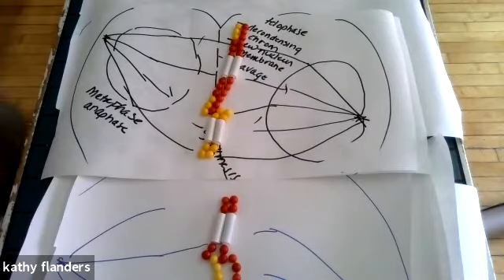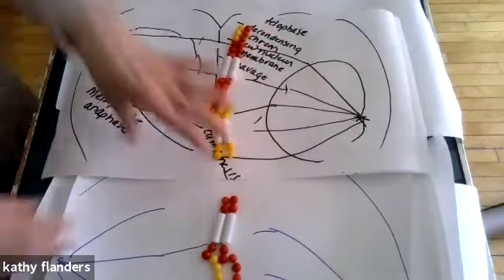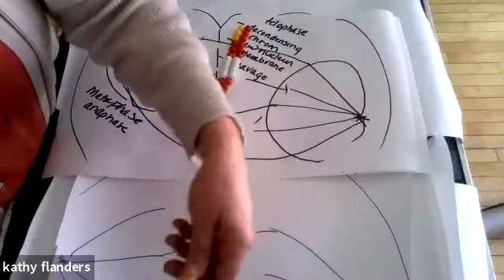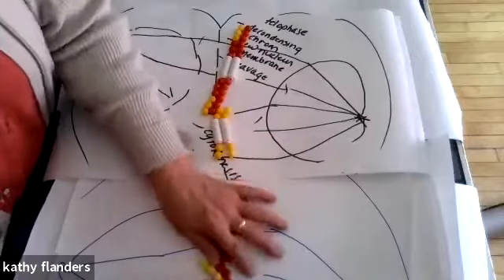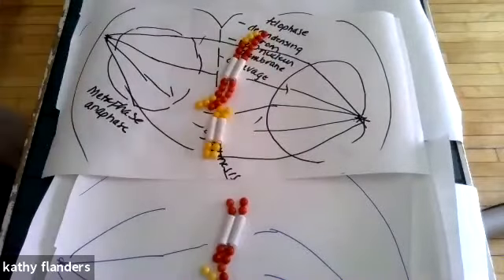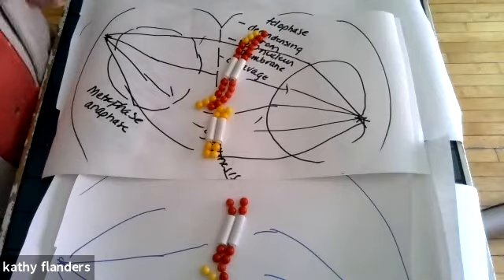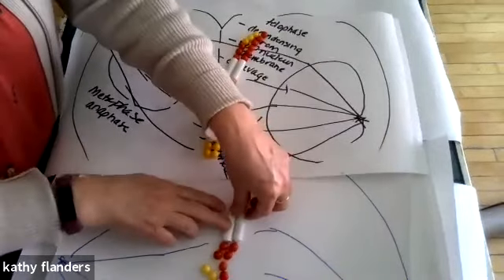Thank you, Tyler. All right, so metaphase, my chromosomes in the form of sister chromatids, because I've got 2 of them attached together, are lining up at the center. So Brian, what's going to happen in anaphase? The sister chromatids separate and become daughter chromosomes.